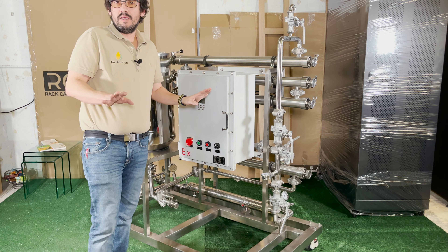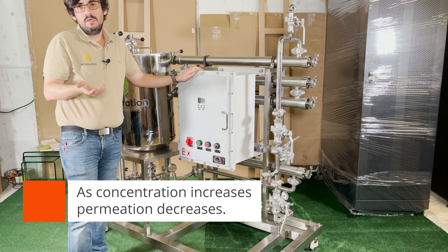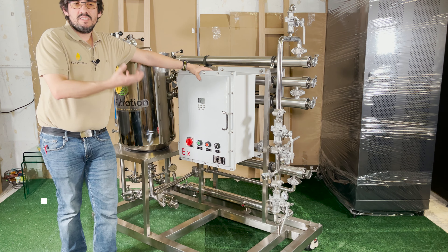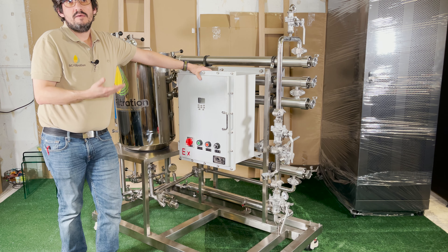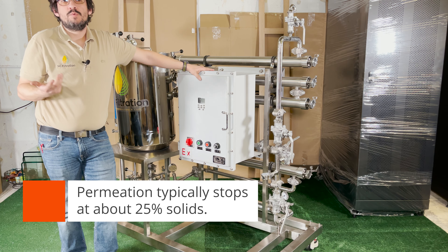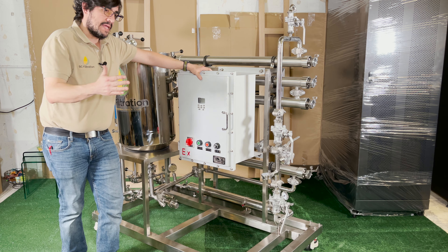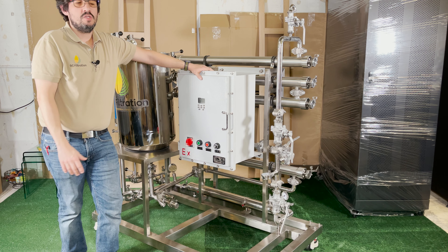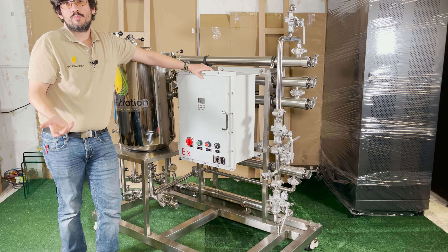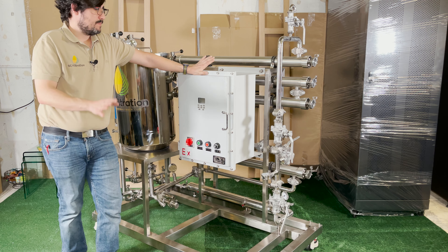Over time, as you move through your batch, the permeation rate will decrease. As the concentration decreases, permeation will decrease — you reach a point where the viscosity, osmotic pressure, and related factors make it not feasible to continue. You may have started filtering at 50 gallons per hour for winterization or 100-plus gallons per hour for solvent recovery, but at the end of the batch you're down to something very slow. At that point you've reached a concentration of about two or three parts solvent to one part crude, and the viscosity is so thick that not much can flow through.